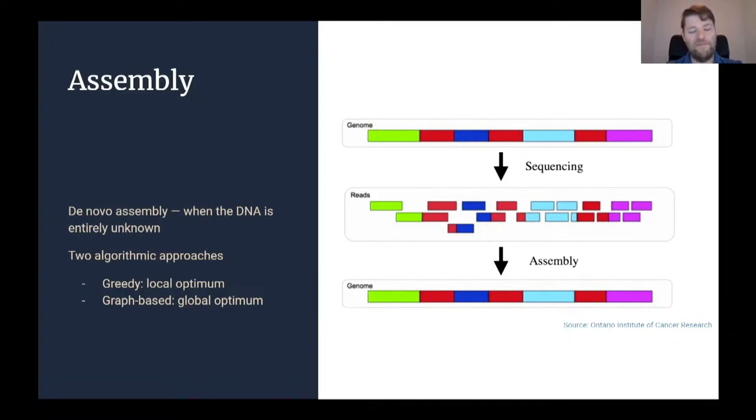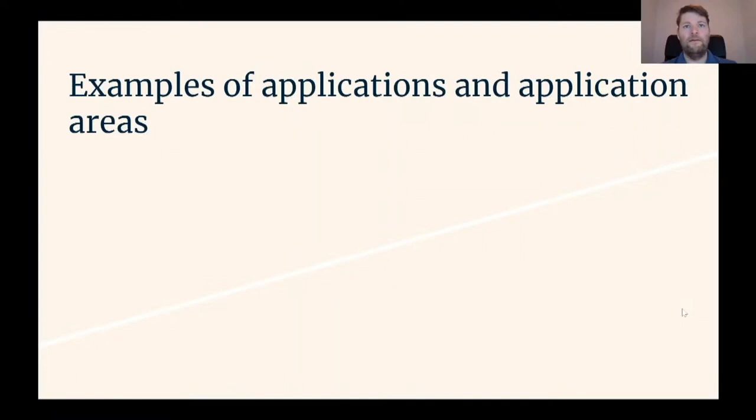And there's a graph-based alternative that aims for the global optimum, and that's kind of where most of the software is going these days. It's a lot more computationally expensive, takes a lot of time to do, but gives you at least a global optimum result.